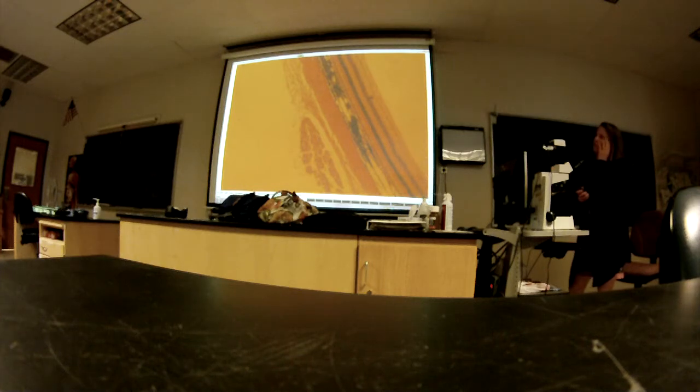Yeah, actually, I guess that's the only right answer for that, because if you say fibrous tunic, that also includes the cornea, so it's got to just be sclera. And then the main layer from here to here? Choroid. The choroid. Good.